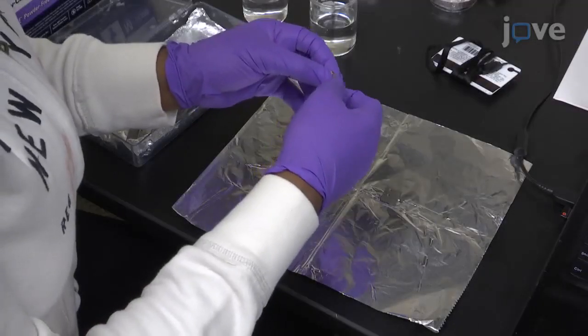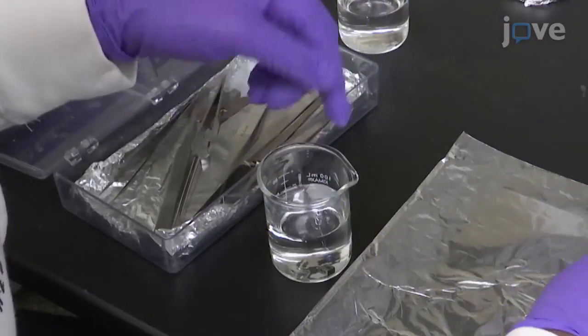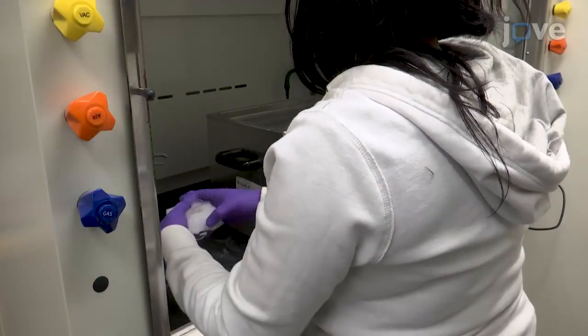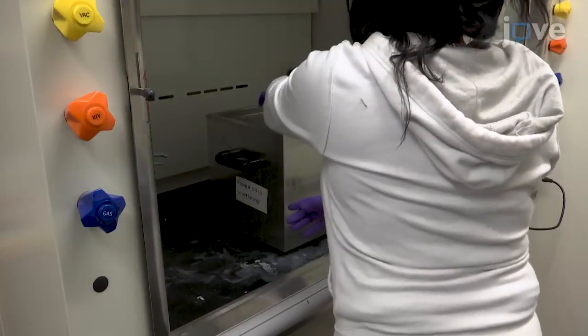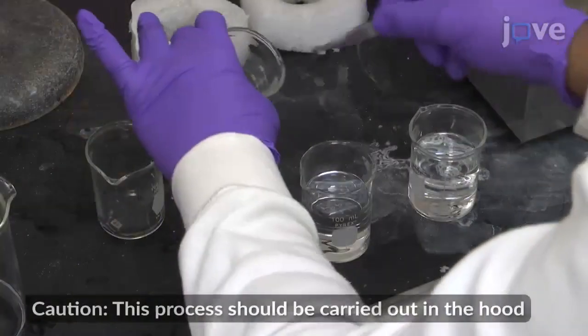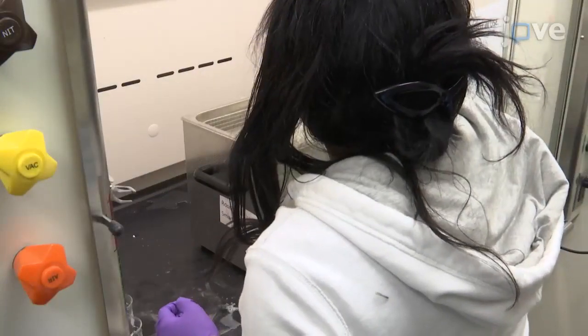To begin, disassemble the U-shaped device and place it into acetone. Clean the device, the micrometer screws, the Belleville spring disks, and the base plate by sonicating them for 20 minutes. Then transfer them into isopropanol and sonicate them for an additional 20 minutes.